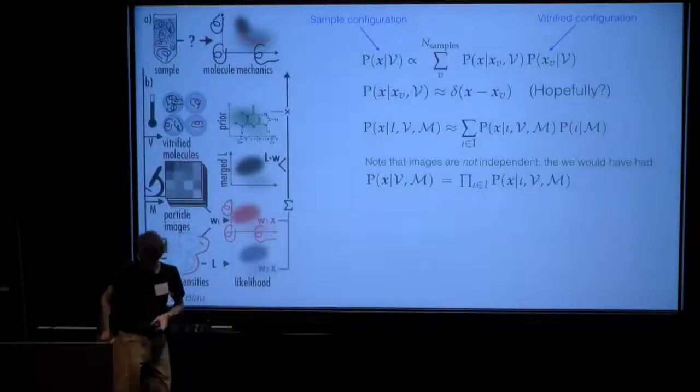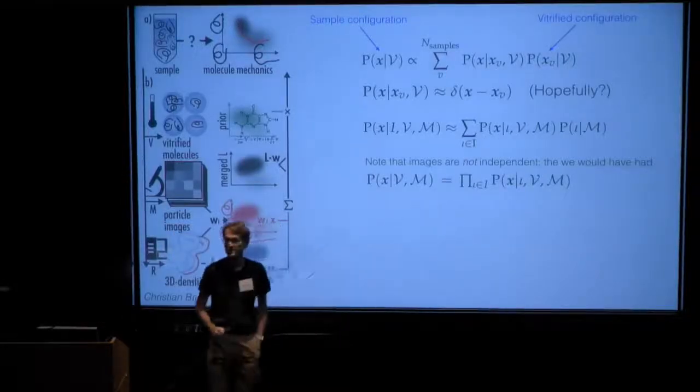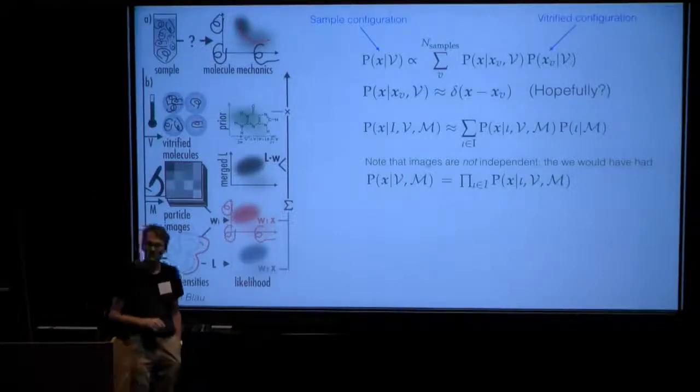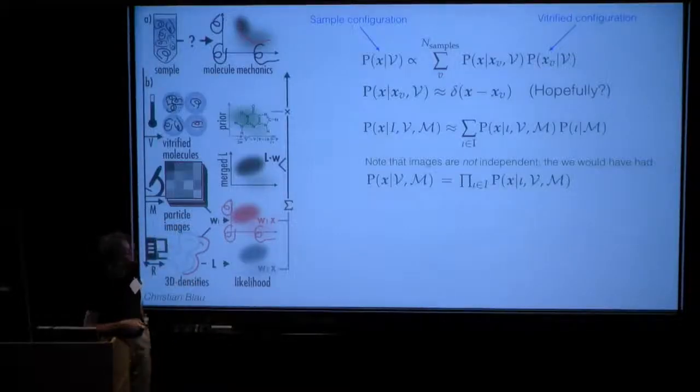Actually, both Pilar Kosia and Gerhard Hummer have looked into quite a bit on how to determine that part. If you can determine that part, you've solved the entire problem. And if you're a young student getting into cryo and particularly mathematics, that might very well be where you should start looking, because computers will get more powerful all the time. Today, that would be too expensive to do because it would be hundreds of thousands, well, millions of images and hundreds of thousands of orientations and everything.